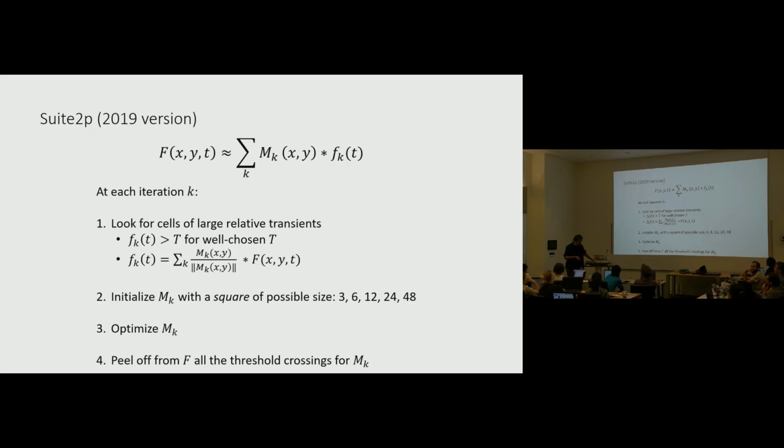The threshold changes adaptively based on a few things. One, it changes based on the spatial scale of the problem. What I didn't tell you is that we actually tried different possible sizes of these initializations, because different people's data will have different zoom factors, different sizes of ROIs, right? Your ROI might be 6 pixels, or it might be 60 pixels. So the first thing that happens is we identify the right spatial scale, and from there on, we make sure we try all the different sizes.